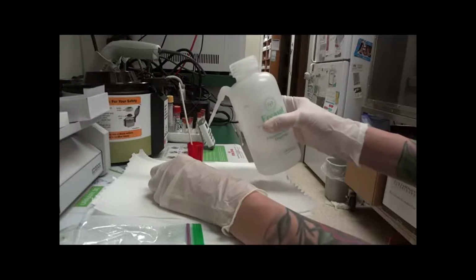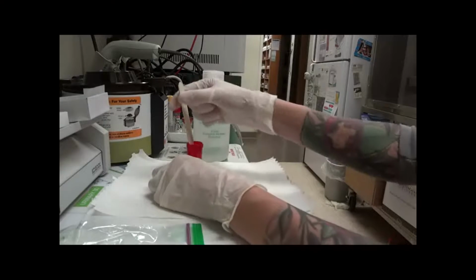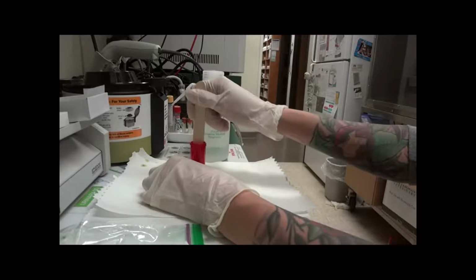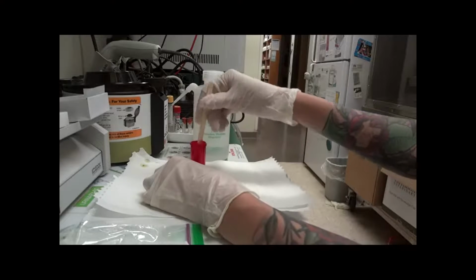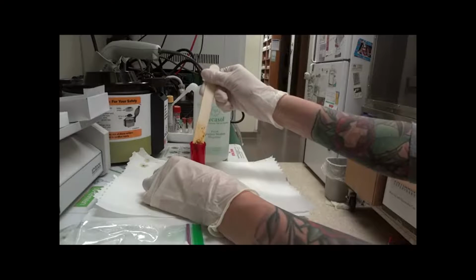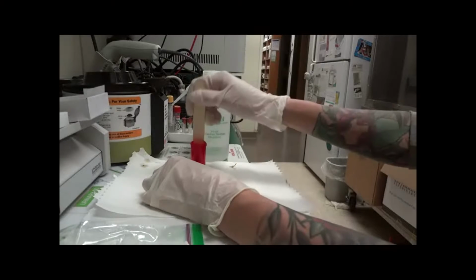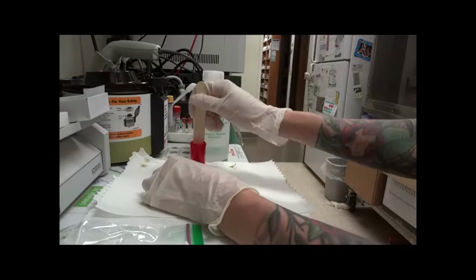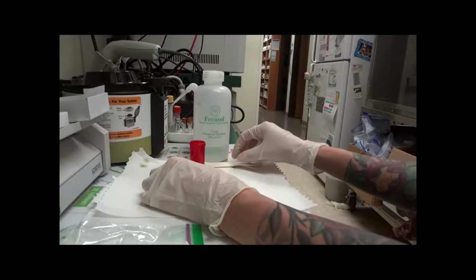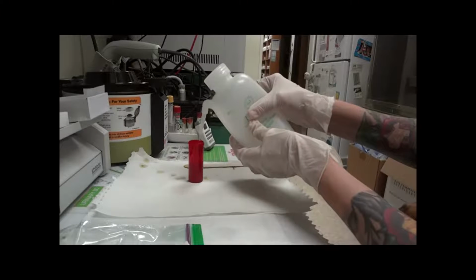We'll then fill the vial about 3/4, and mix the feces up with the fecusol. Removing any grass or large lumps. Then we'll fill the rest of the vial up until we get our meniscus at the top.